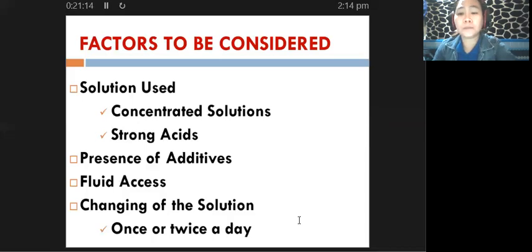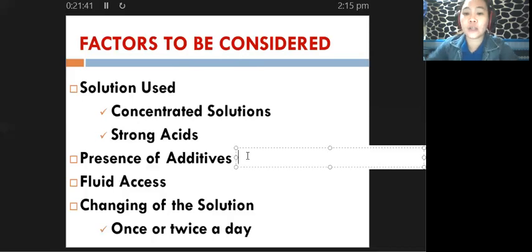In order to protect your tissue samples from the damaging effects of acid solutions, you can incorporate additives in your formulations. Additives oftentimes utilized for acid decalcifying solutions include alcohols and buffers.